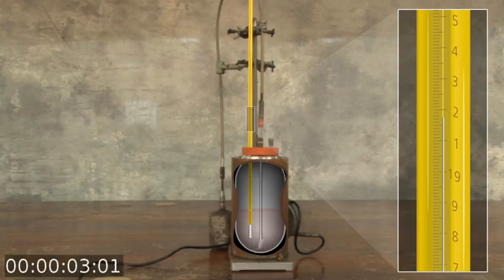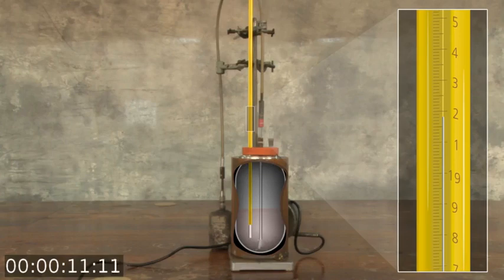We start the chronometer and you now need to take temperature readings at 1 minute intervals for 5 minutes in order to define the slope of the pre-reaction period. I will rejoin you again shortly before 5 minutes have elapsed.